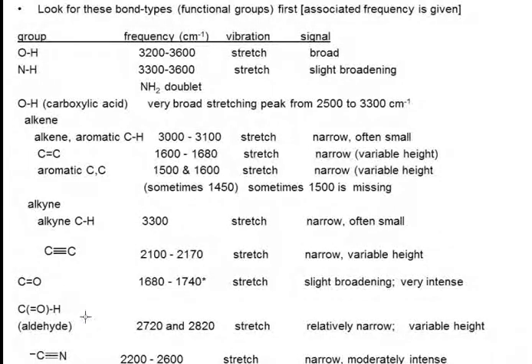Next, look for an aldehyde. I think we've also mentioned that when you look at the other chart. An aldehyde CH stretch produces two peaks, 2720 and 2820.